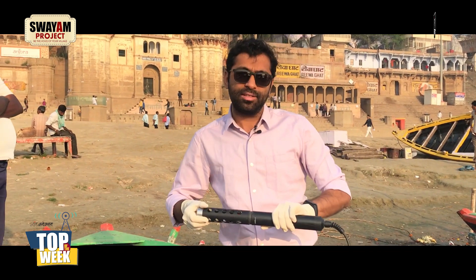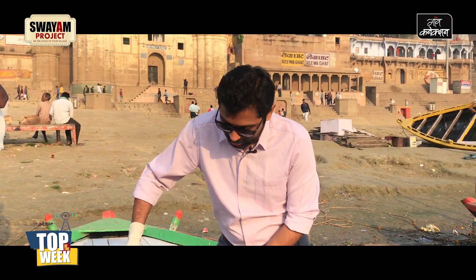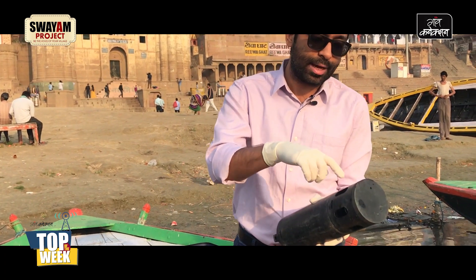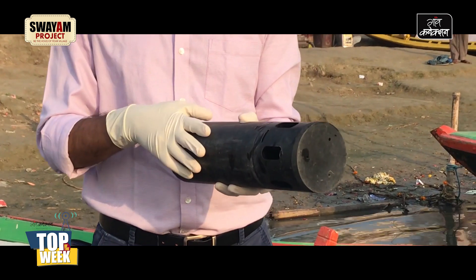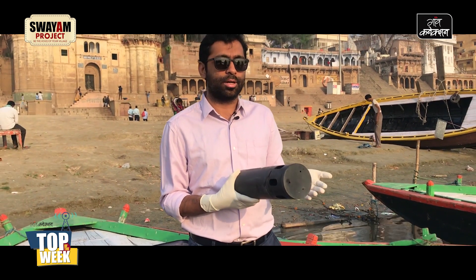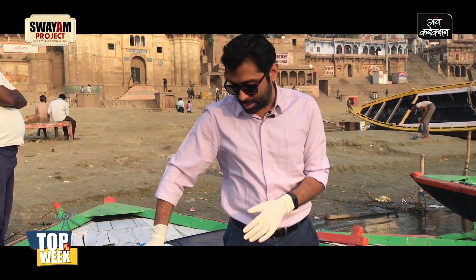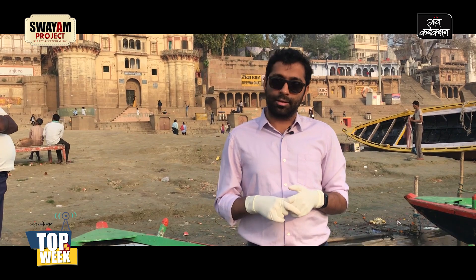A bunch of other parameters that we measure include fluorescence values, which are mostly optical parameters. This thing here is a Turner C3 fluorometer. Inside — this is a protective case — there are three different measurements: chlorophyll, CDOM fluorescence (which is colored dissolved organic matter), and tryptophan fluorescence. Tryptophan is an amino acid found in organic content, so if pathogens are present or there's organic content in the water, you'll see a higher range of tryptophan fluorescence.